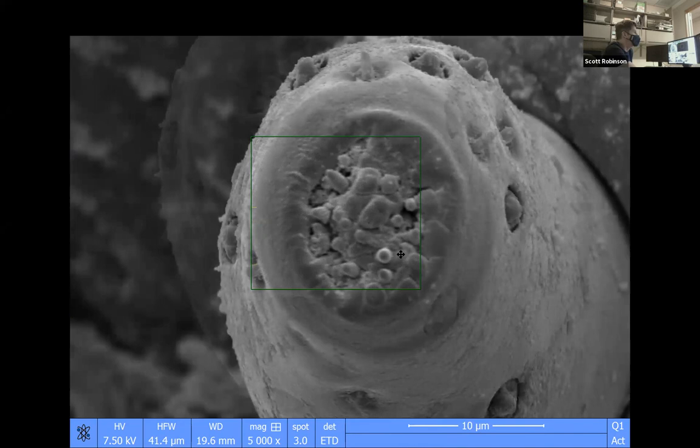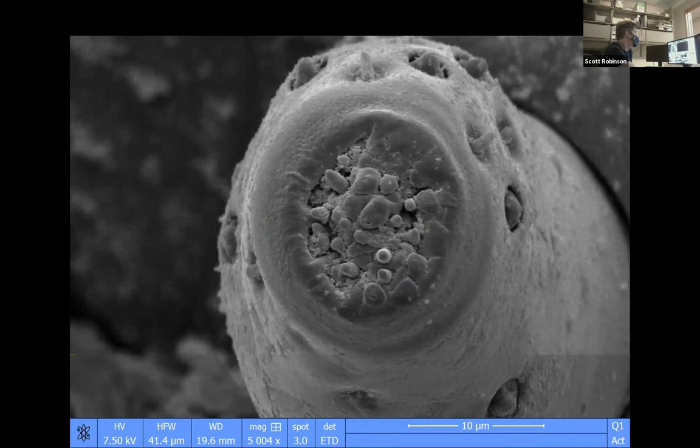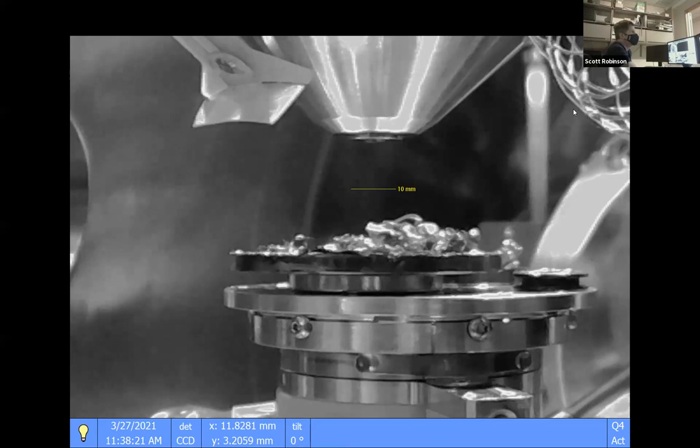And then the electrons that come back from the sample go to a detector. And the detector that we're using in this case is, if you see what we have on the screen now, you see a cone shape on the top. The cone shape is where the electrons are coming down the column. And we have a very poor image of the samples that we're looking at with this CCD camera.